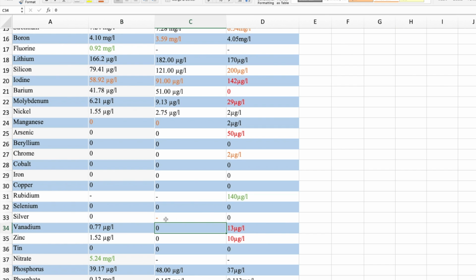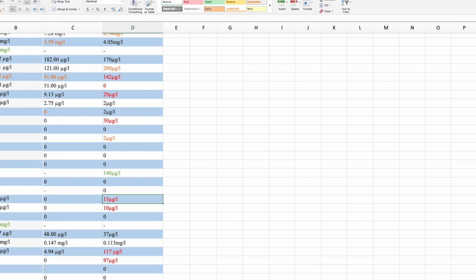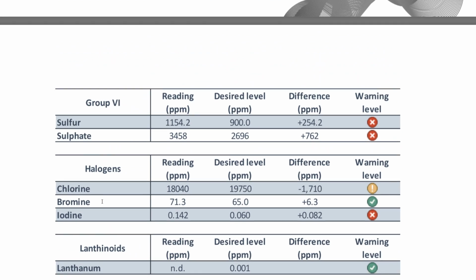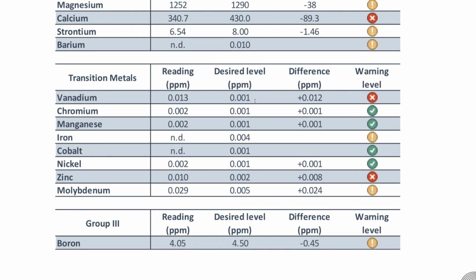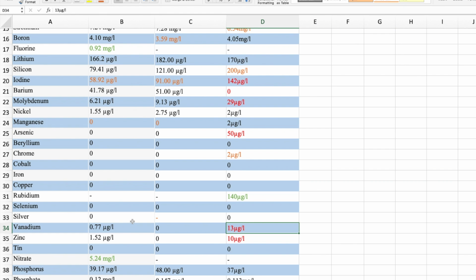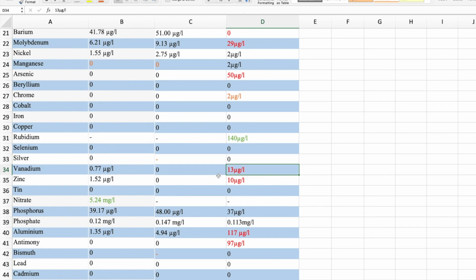This one was interesting. Vanadium is tested by all three, and I got not detected by Triton, a very small amount from ATI, and a huge amount from Quantum, which again is making me feel like that's possibly the one that's inaccurate. Let's see what the set point for that is. The desired amount is almost non-existent, and my result was considered way over that. So it could be the case, but I'm not sold, considering that we want to see pretty much this value or lower. We've got that value lower, and then we've got significantly more than that found there. Again, make your own opinion.